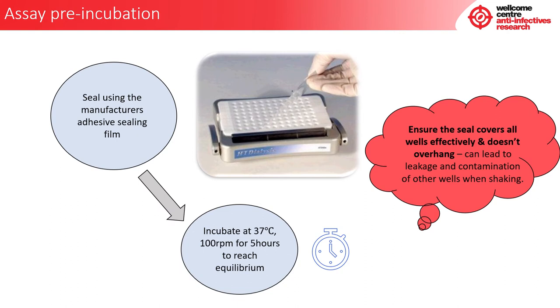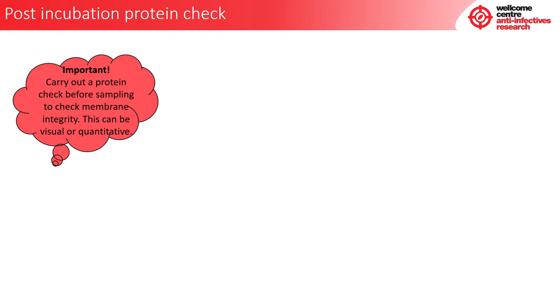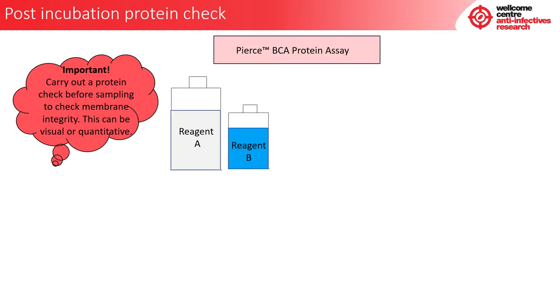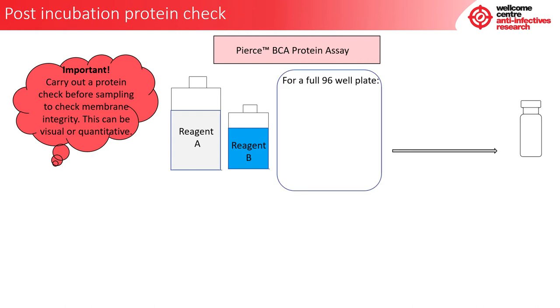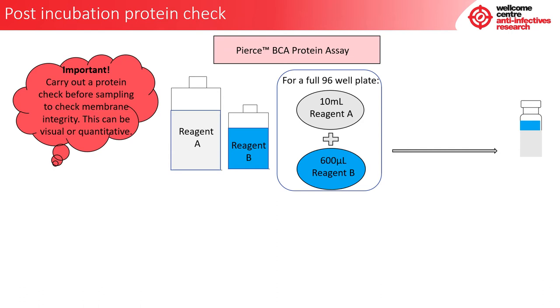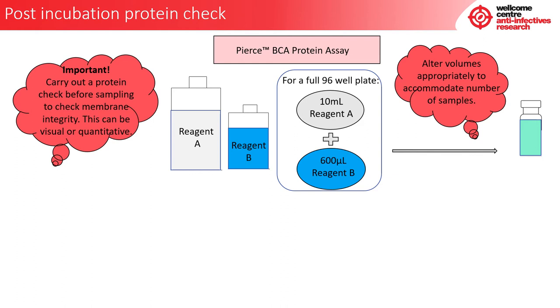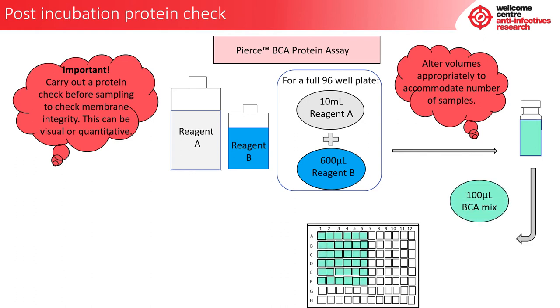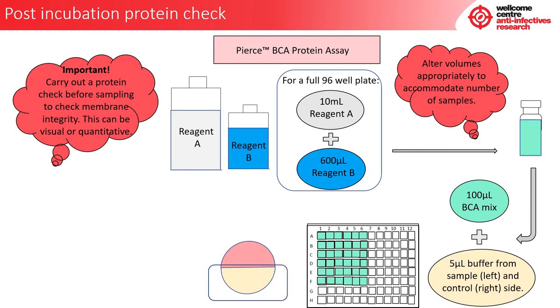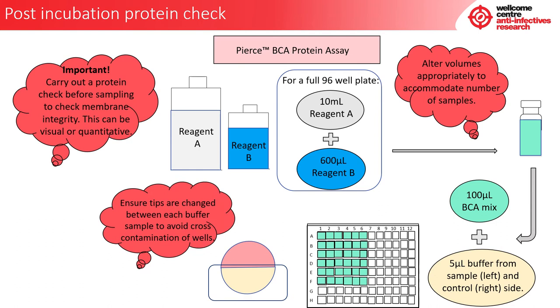Now incubate your dialysis block at 37 degrees Celsius, 100 rpm, for 5 hours to reach equilibrium. It is important to carry out a protein check prior to sampling to check the membrane integrity; this can be quantitative or visual. For a visual check using the Pierce BCA protein assay, which includes reagent A and reagent B: for a full 96-well plate, add 10 ml of reagent A and 600 microlitres of reagent B and vortex to turn green. Then into a fresh 96-well plate, add 100 microlitres of BCA mix and 5 microlitres of buffer from the sample side and the control side of the dialysis block, changing tips between each sample to avoid cross-contamination. Leave on the bench for 15 minutes.